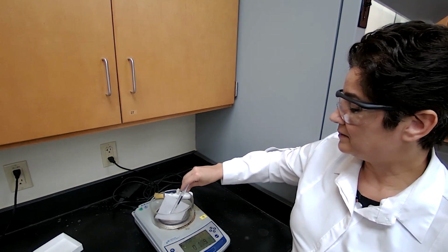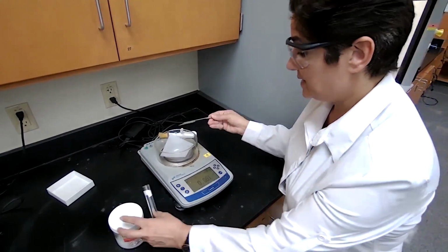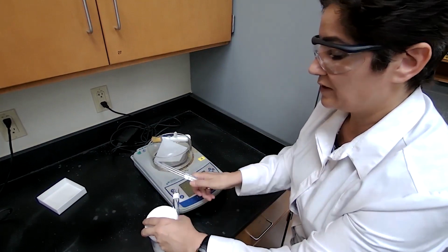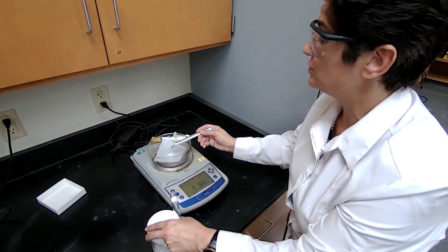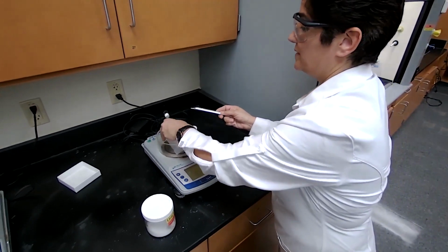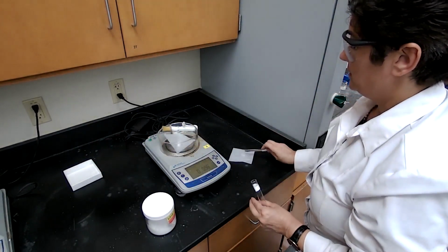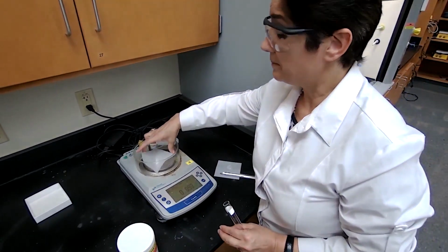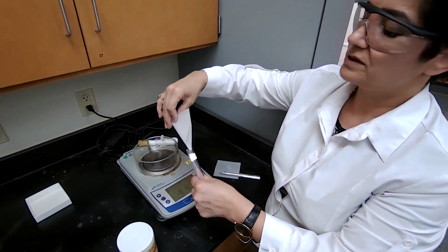If I take that tip of a spatula, it is about 0.08, and that should be good enough for the solubility test. I just want to show you how much it is going to be. It's a very small amount because I don't want to saturate the mixture. So 0.096, about 0.1, and I would transfer that into the test tube.